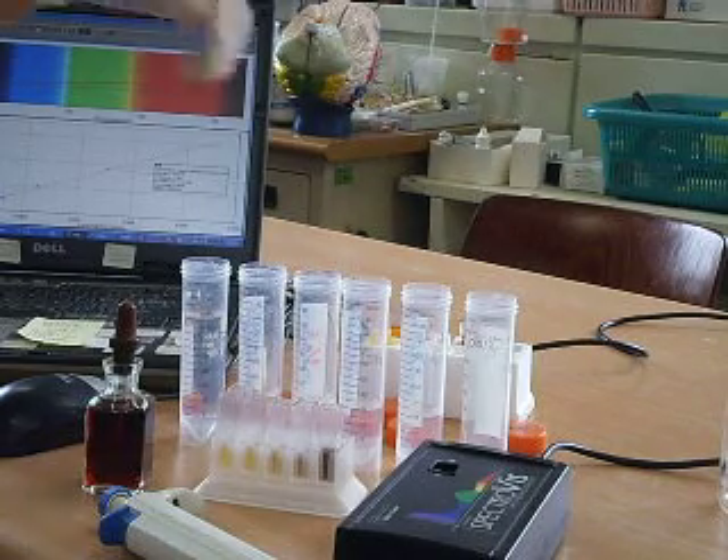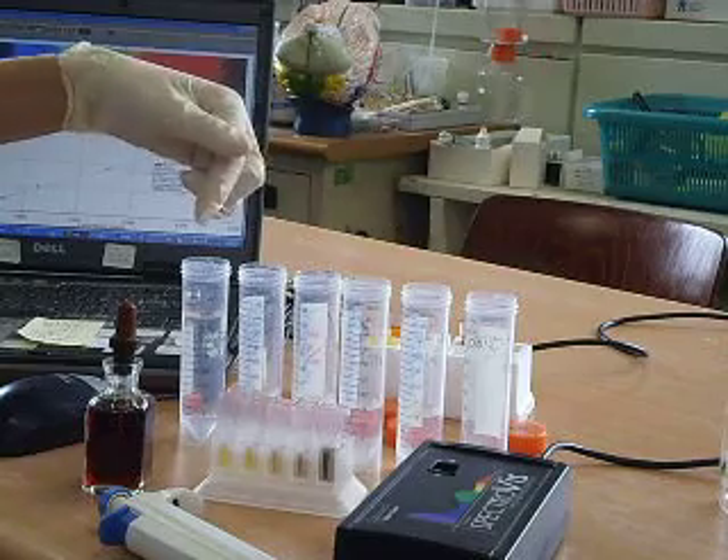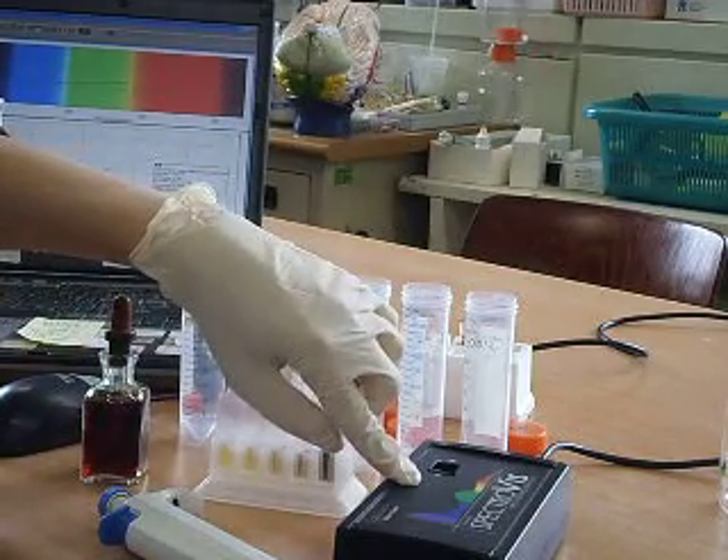In this video tutorial, I'm going to demonstrate how to quantify starch using iodine and a visible spectrophotometer.